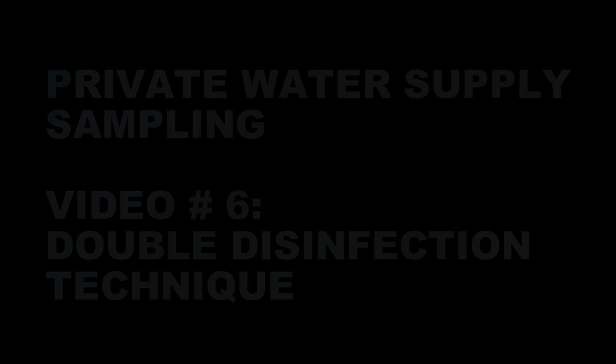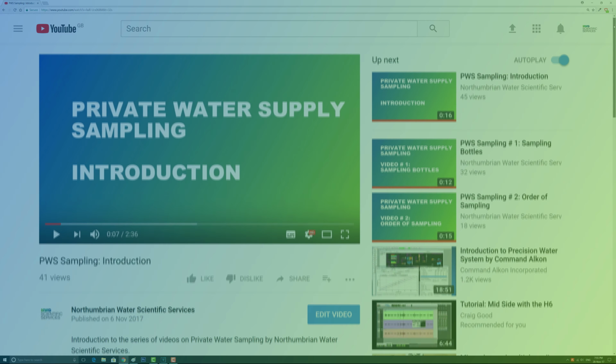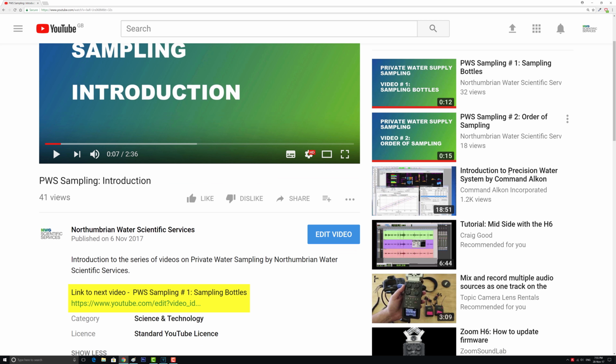This is the sixth in a series of short videos designed to provide you with guidance on good sampling technique. In this video we're going to explore the recommended tap disinfection techniques to employ before you take any microbiological samples. In this sixth video we may make reference to other videos in the series, and when we do this we'll ensure that links to the reference videos are available at the foot of the playing window.